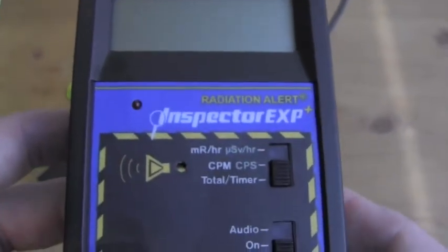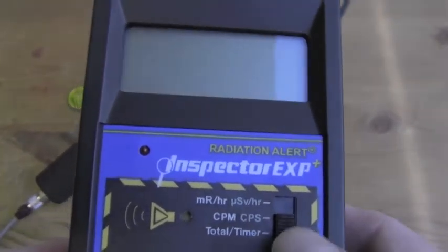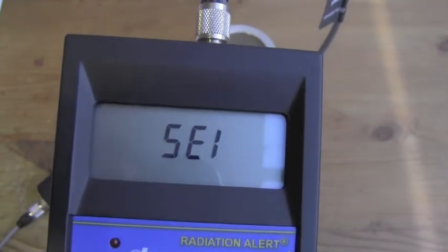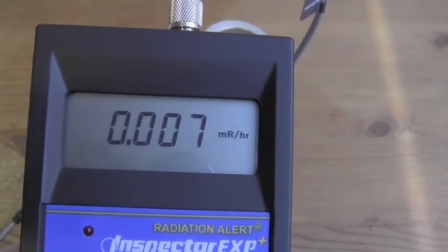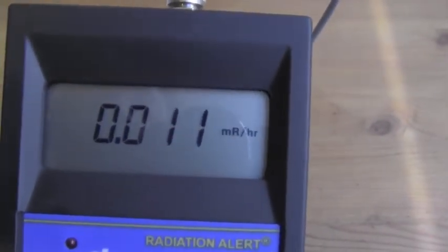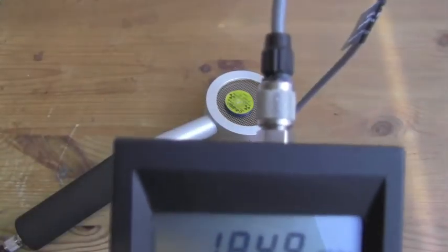Now we'll test the survey meter with this CS-137 calibration source. We'll first make sure it's set to dose. We'll turn the survey meter on with audio. We're going to zero, and now we're detecting background. I will place the source on top of the probe window.